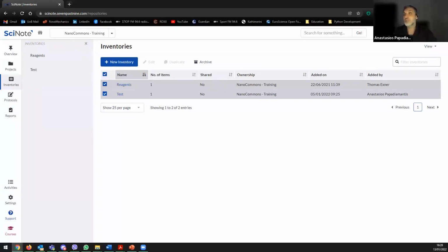Yes. To come back to Rashid's question about data privacy, safety of results, and protocols. I don't really know. Theoretically, the results, as I showed so far, are kept and shared between specific teams. So let's say if you have a project that people are assigned to, then these people will be able to access and see your data.